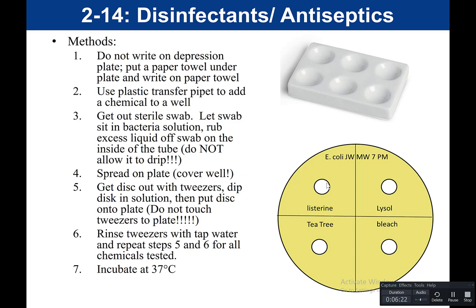Take a disc and dip it in the Lysol, then put that disc on the plate. Rinse them off, get another disc, put it in the tea tree — same thing for all your chemicals. Once you add those discs, turn your plate agar side up, because we always incubate plates agar side up, and put that plate in the incubator at 37 degrees Celsius for 48 hours.